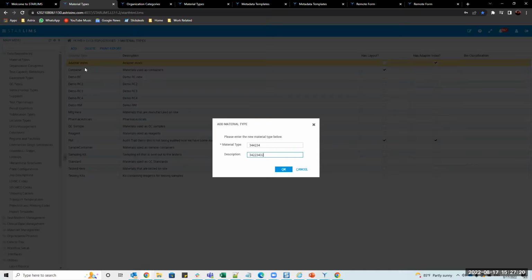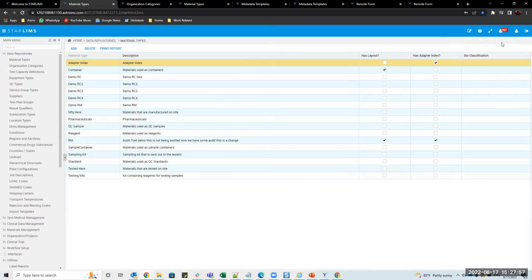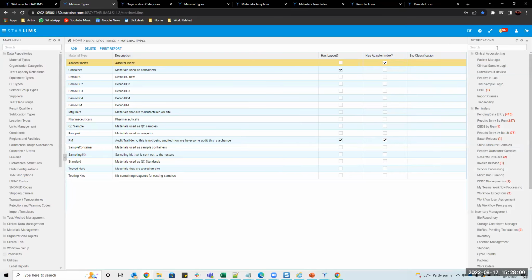But with the new HTML, you can make it so that it doesn't wait and it actually goes and does whatever it needs to and however long it takes, assuming it's actually executing things and not like in a loop or something that's going to time out. And then you give control back to the user, and it gives it a sense of performance, right? Because you're not stuck there with a little hourglass waiting. So you can still move the cursor, you're still moving. You give a visual cue that something's happening, maybe like a please wait on a specific grid. You know what? Instead of looking at it in the designer, let me show you what I'm talking about.